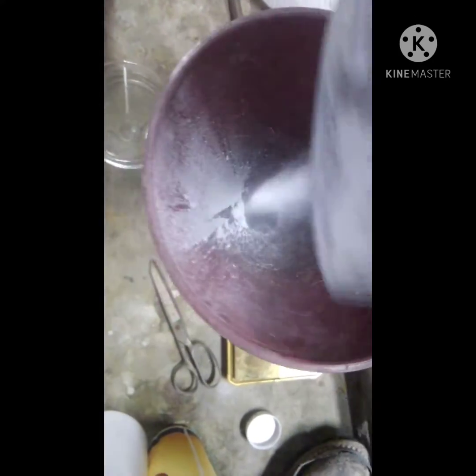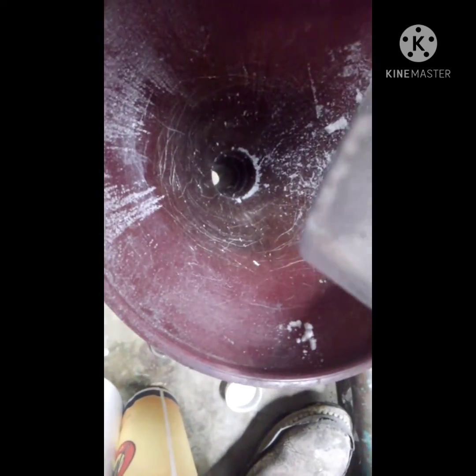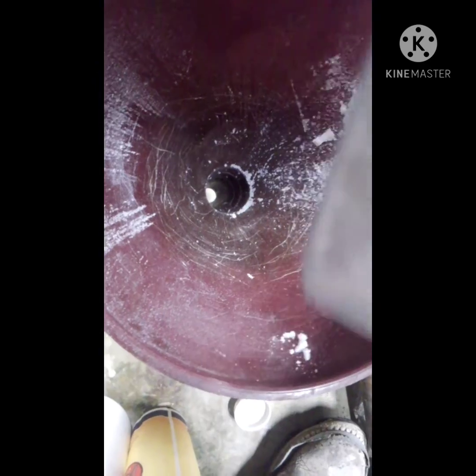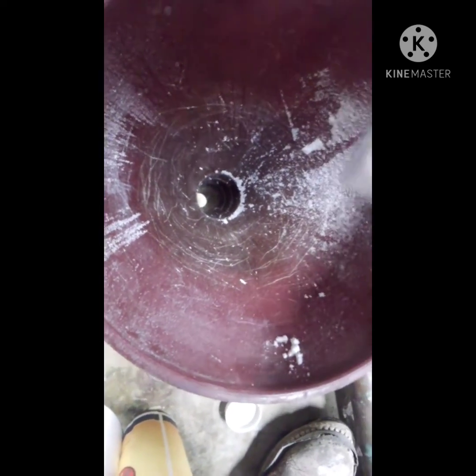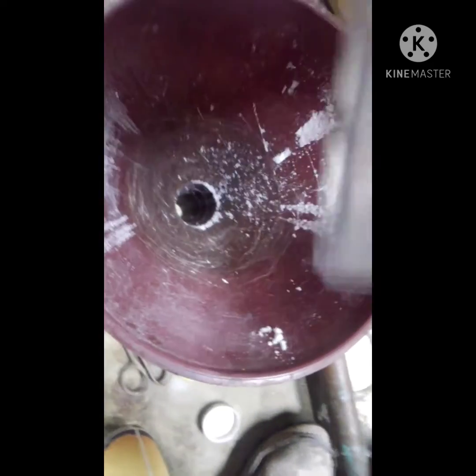Now if you want to make a specific mesh size from here, you screen it to your desired mesh. For me being a hobbyist, it's not really that important, especially since this is just for TLC plates, not for the actual chromatography in a flash column or whatever. So it's not crucial as far as I'm concerned, again, for me being a hobbyist.